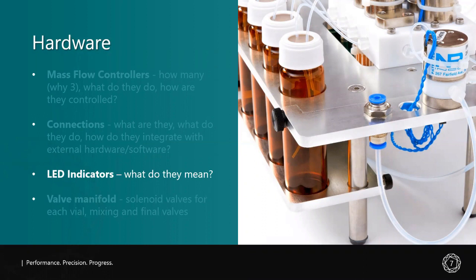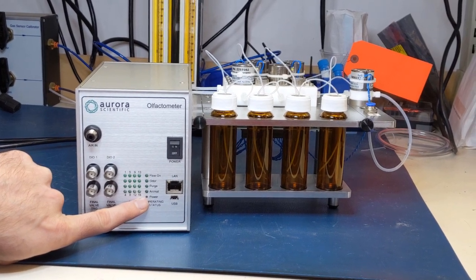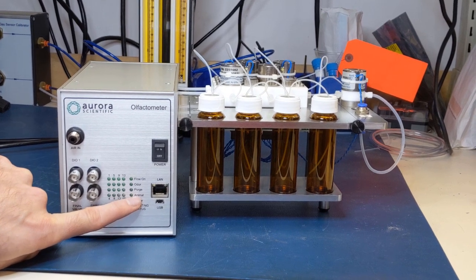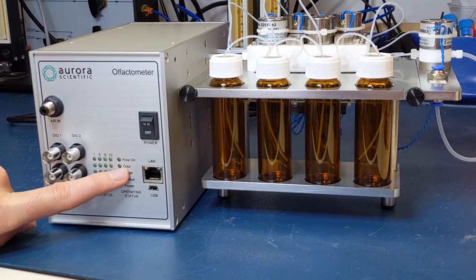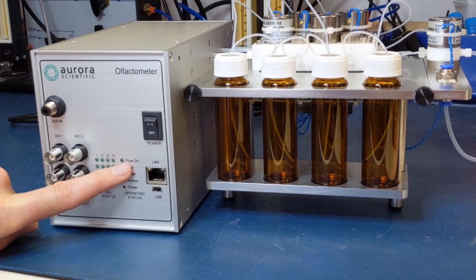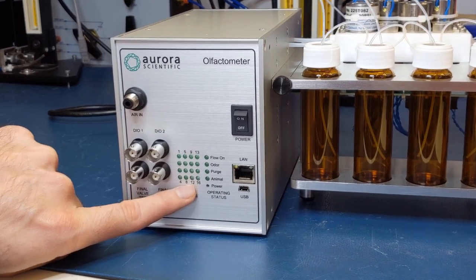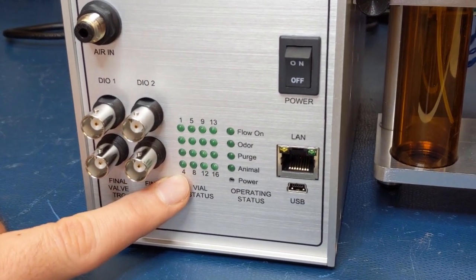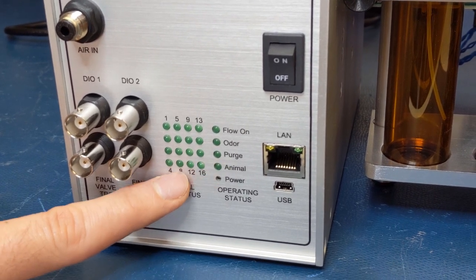You may have noticed numerous green LED indicators on the front panel — what do they mean and why are there so many? When the power switch is turned on, the power LED will illuminate. Above that are LEDs that indicate odor and flow status. The animal light is on when odor is delivered to the animal. Purge illuminates when purging the system of odorant by opening all valves. The odor LED is on when an odor vial has been selected and in use. And the flow on LED will illuminate when air is flowing through the system. Next to these are your vial LEDs, which indicate what vial is currently being used. There are up to 16 odorants that can be used with the system. Each column represents a set of 4 vials, corresponding to each model of olfactometer — the base unit of 4, plus a series of add-on modules to expand to 8, 12, or 16 total.